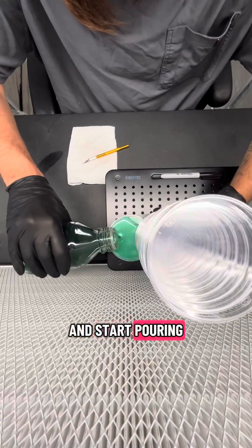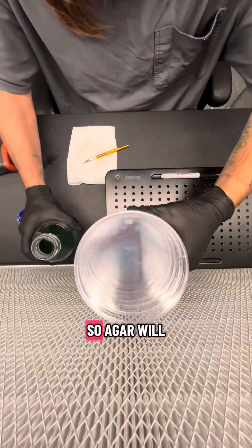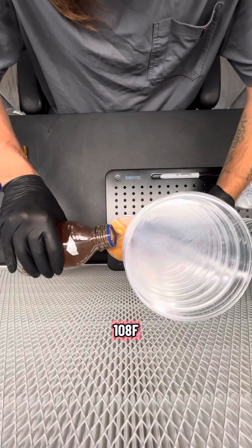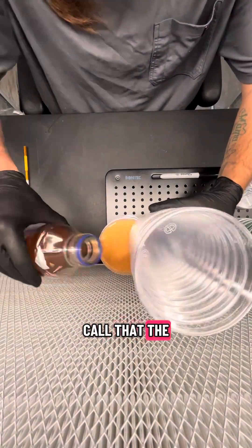In a nice easy motion, grab the bottom plate and start pouring your way up the stack of petri dishes. Agar will solidify at around 108–109°F, so when you pour around 120–130°F, I like to call that the sweet spot — you can kind of take your time.